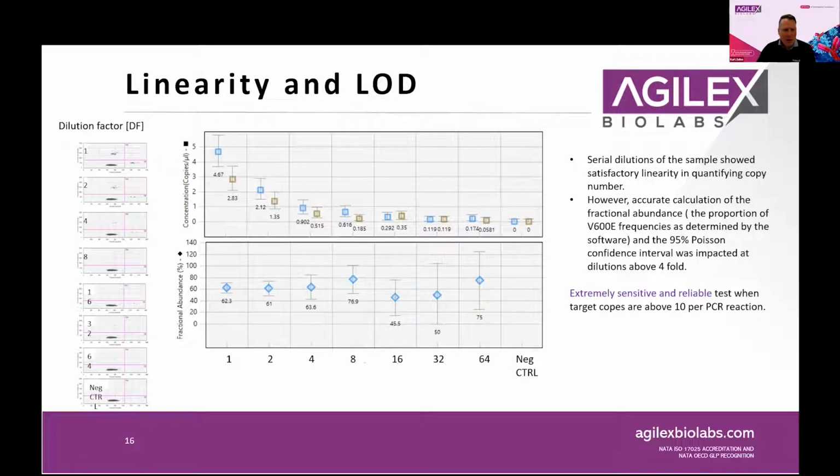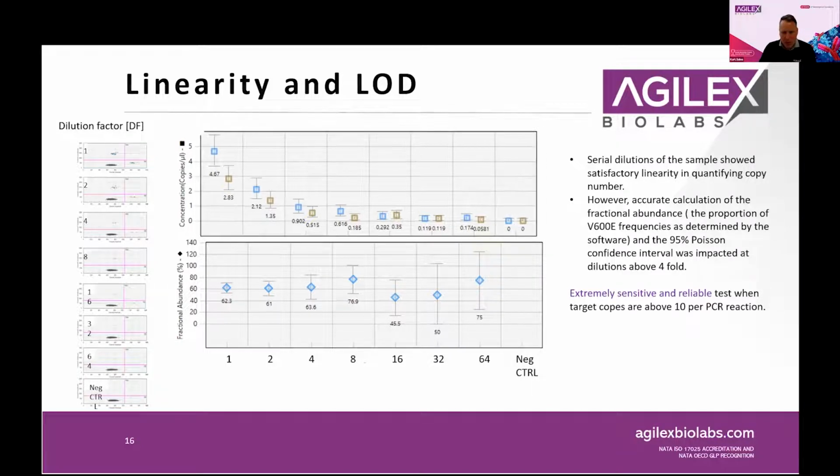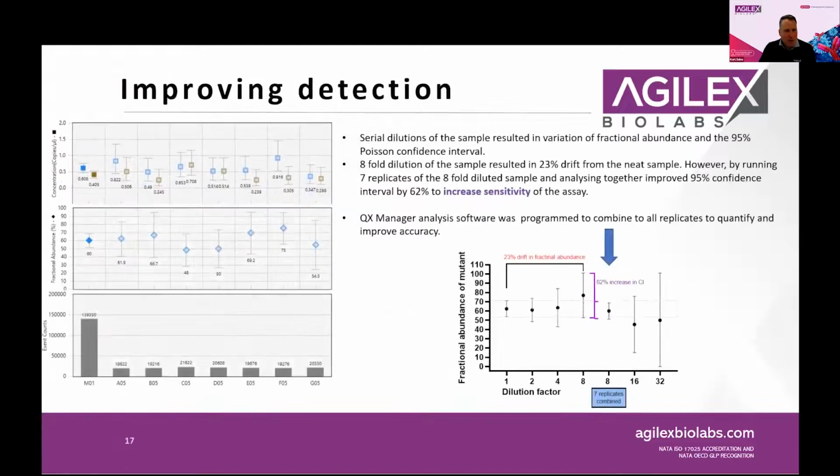So how do we correct for this and how do we improve the sensitivity of detection so that you can dilute out your sample and really get to an absolute copy number? Because the reaction is partitioned into 20,000 droplets for a digital PCR setup, you can actually do the reaction in singlet because you've got the power of 20,000 within one well.